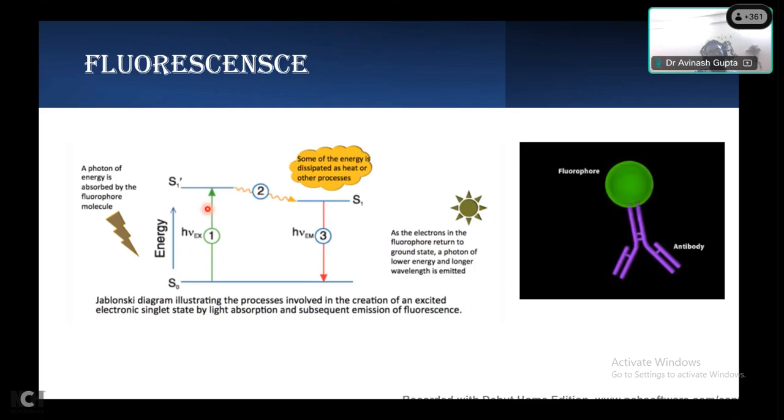These compounds have an unstable electron in their orbit, and this electron gets excited with a particular light, or the light is a source of energy. So they will be excited, their electron goes into a higher orbit, and after some time, because that's an unstable stage, they will release the energy and come back to the ground state. In this process they will emit some light.